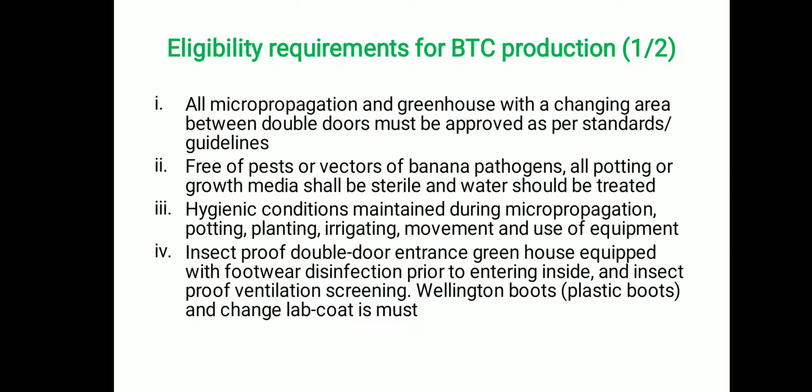The double door entrance should be insect proof, and the greenhouse should be equipped with footwear disinfection prior to entering. Ventilation should be insect proof for incoming and outgoing air. Generally Wellington boots or plastic boots are used to enter and work, and a change of lab coat is a must prior to entering the greenhouse facilities.